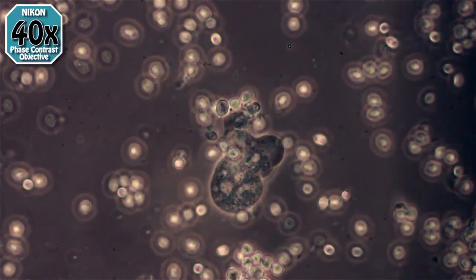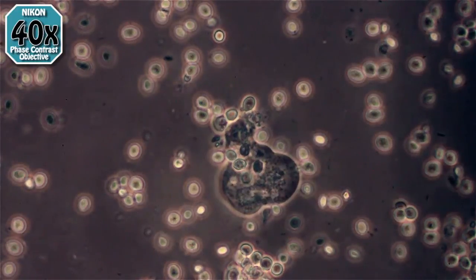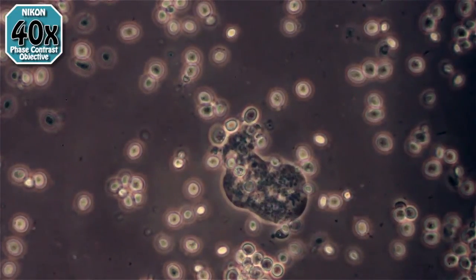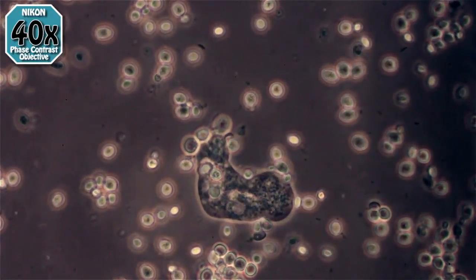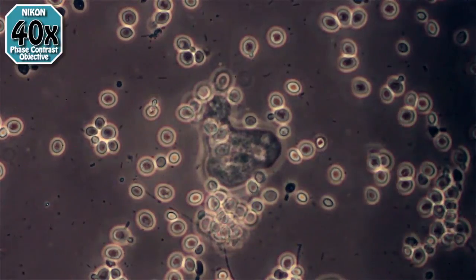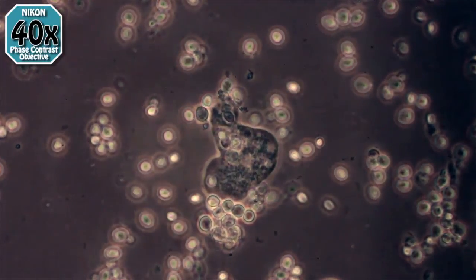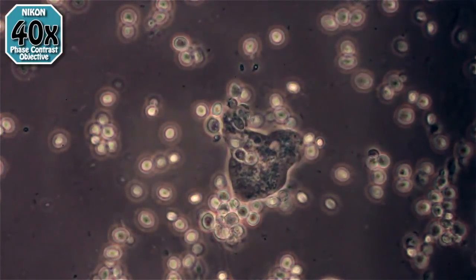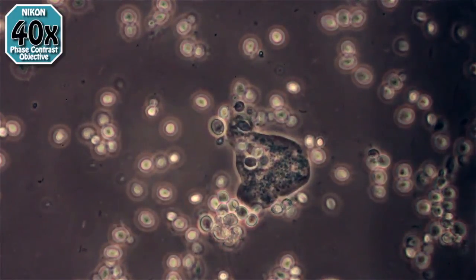This is an unidentified naked amoeba from one of my samples. The sample is a pinch of moss that I collected in my yard last spring, almost a year ago. I put it in a two-inch petri dish and added a little bit of water. I've been adding water periodically to keep it alive, and it's producing amoebas, rotifers, and small ciliates — whenever I need to look at something, this is just one of my sample jars.